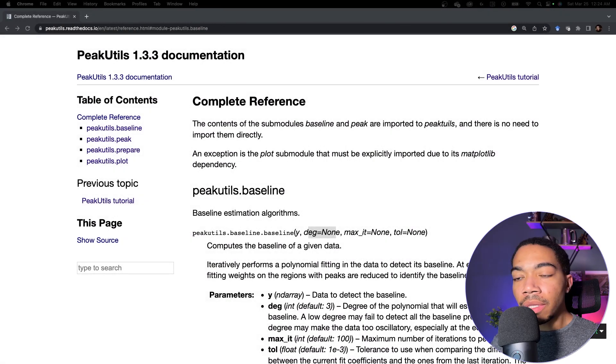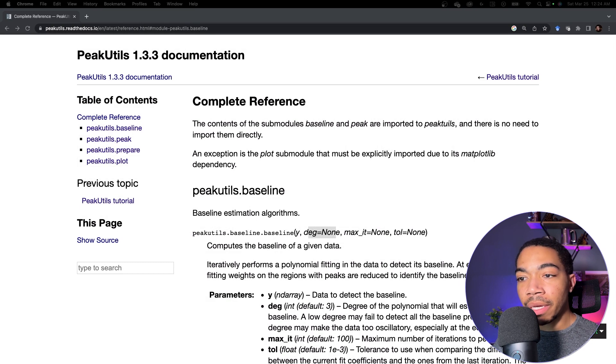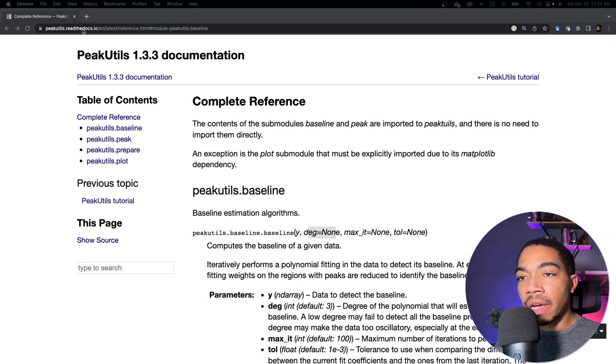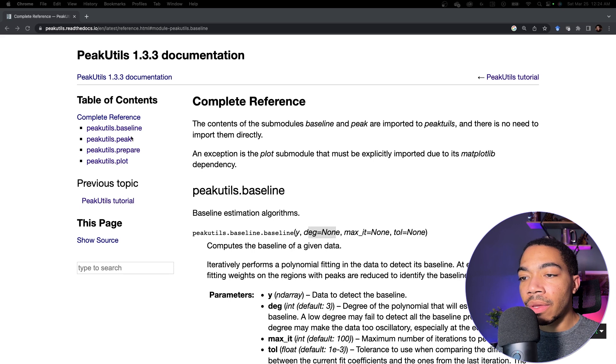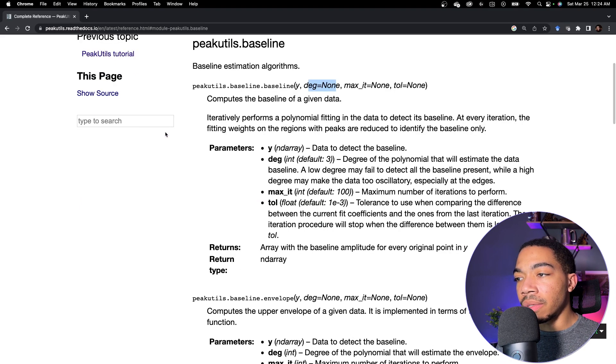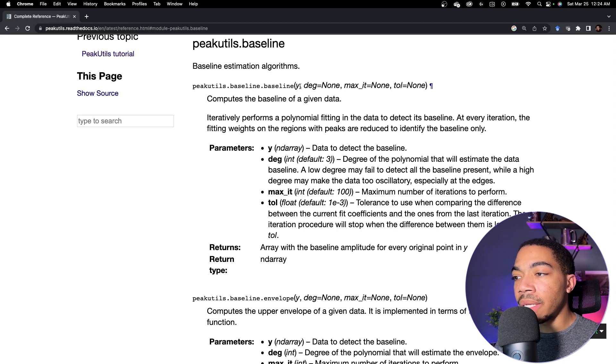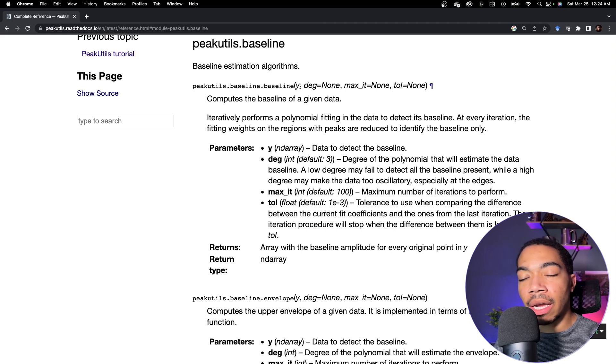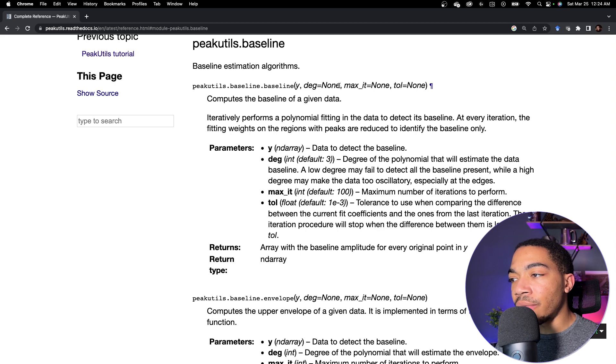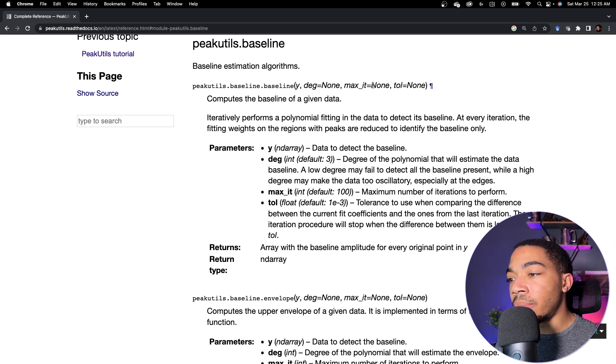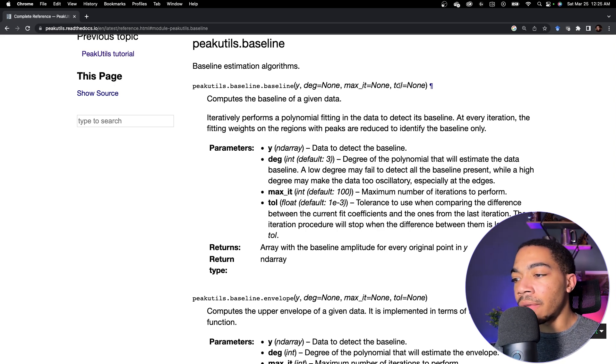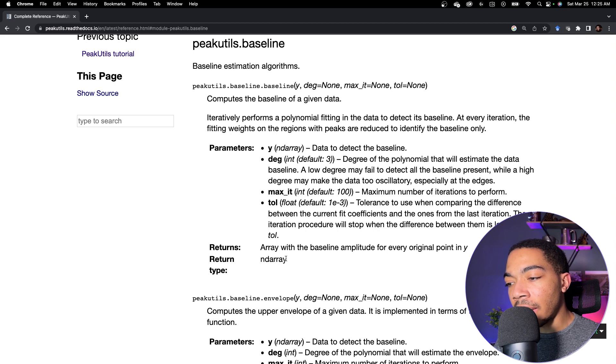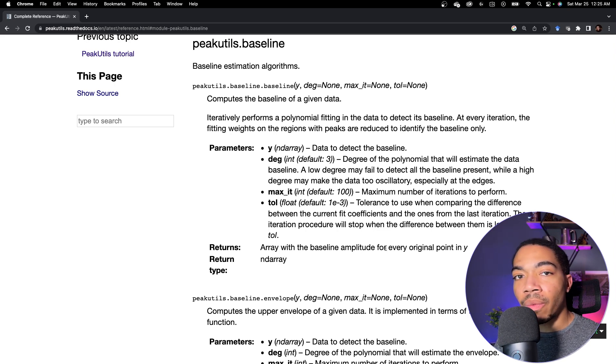To do this, we can use the peak utilities library again. We've used this for peak picking. You can find the documentation here at peakutils.readthedocs.io. And if I go to the peakutils link, you see that the inputs are relatively limited. Here we simply need y, which is an array containing our data. Next, we will pass in arguments for the degree. If it matters, we can use max iteration and tolerance. These tend to have less of an impact, particularly for this data.